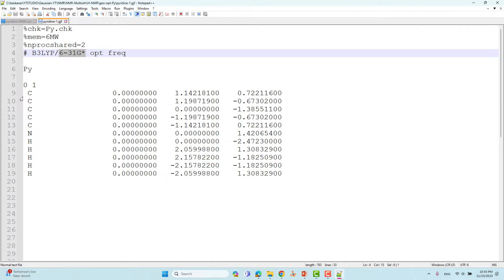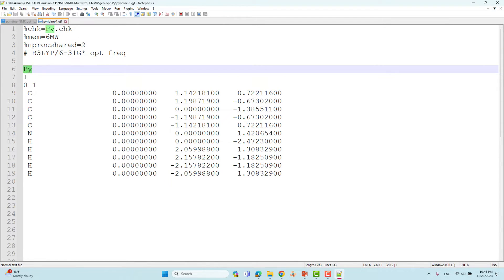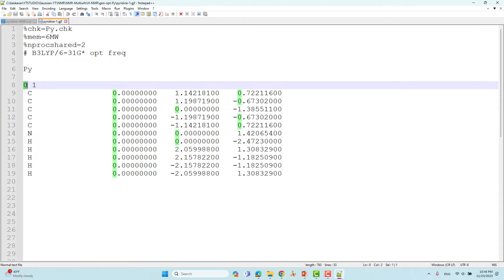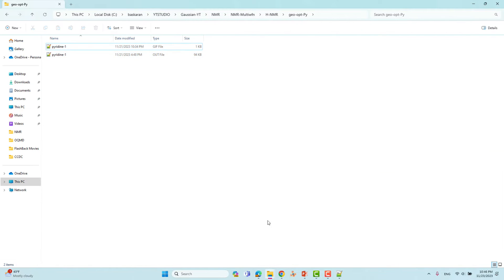The basis set is 6-31G* for all light atoms. If you are using a transition metal you have to use a different basis set — you can watch my earlier video where I explained that. Then you have to put the optimization and frequency keywords. After that give the name of the system, the charge, the spin multiplicity, and the Cartesian coordinates of the molecule.